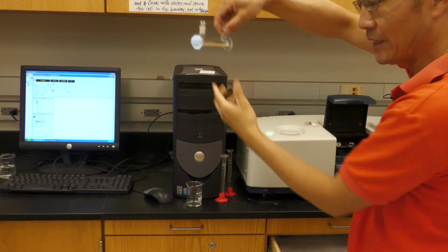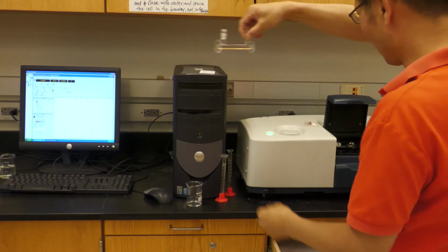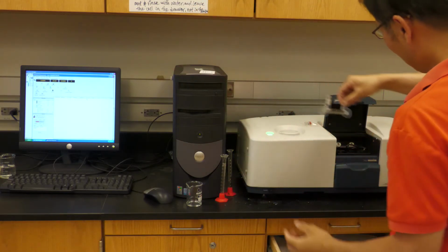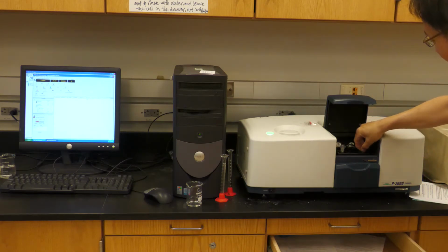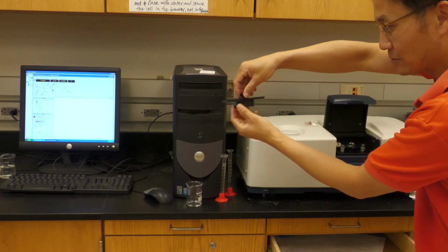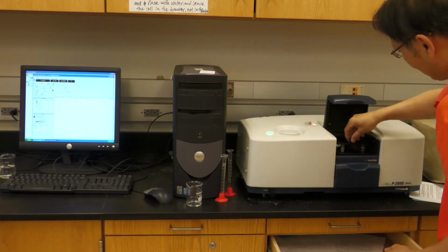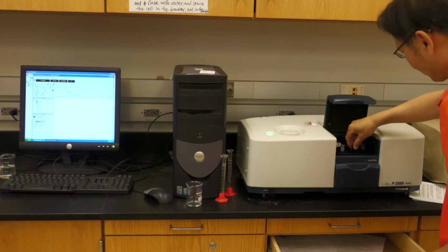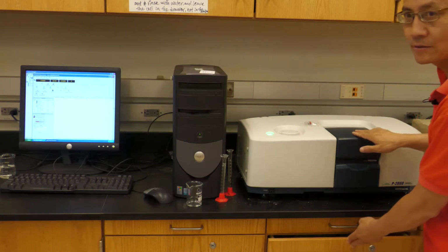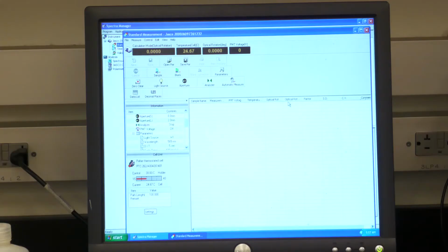Okay, here are the two leads. Now let's put this one inside of this one. Make sure the cutting edge faces the front, and then this one is fixed with this fixer. Okay. So you can see everything is finished. Now we put everything here.